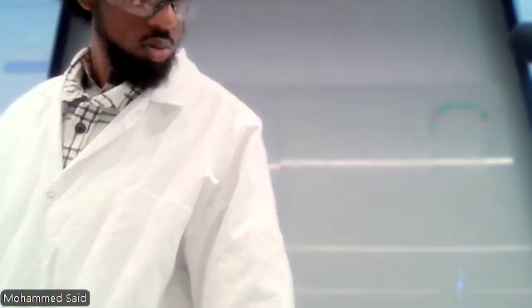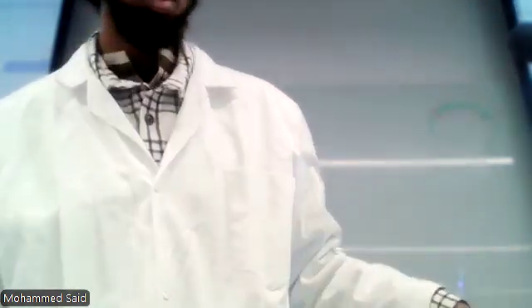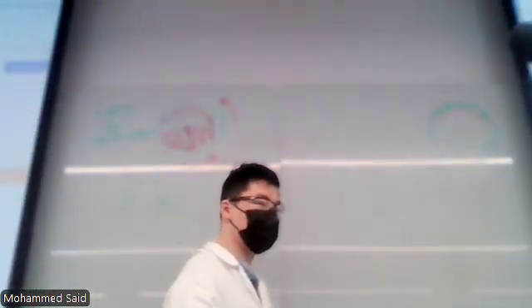Is this the equivalent for transformation, right? You're asking for transformation? It should be. Yeah. The piece for the plaque. Yeah, I placed racks inside. I'll give you an extra one.